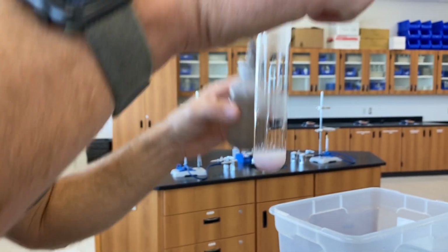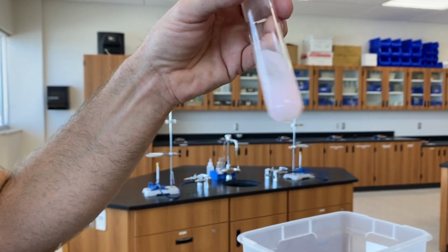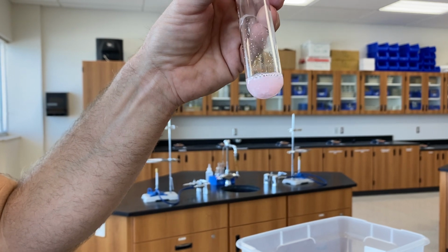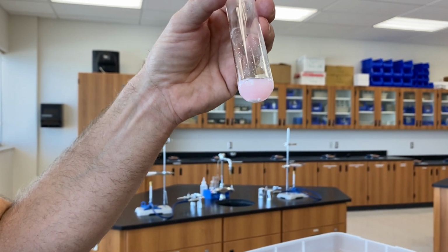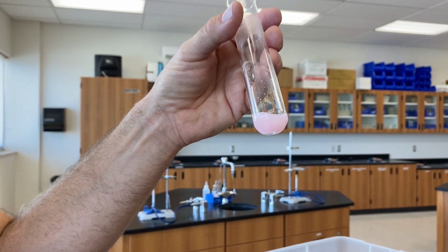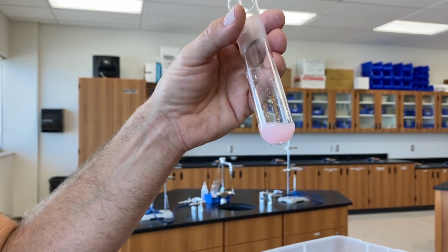All right. So I think you can probably clearly see the precipitate that is formed there. It's no longer clear, it's now opaque. There's a white precipitate in there, but looking at the solution, you can definitely see that that has changed colors, and you will record that in step 12 as your final color observation.